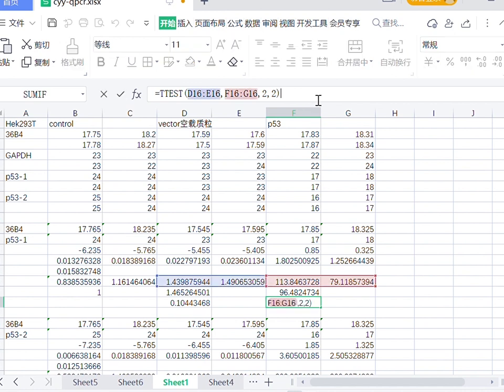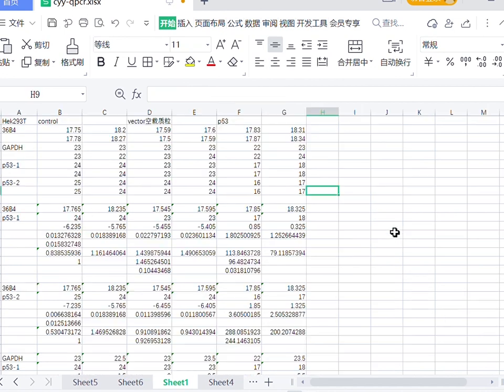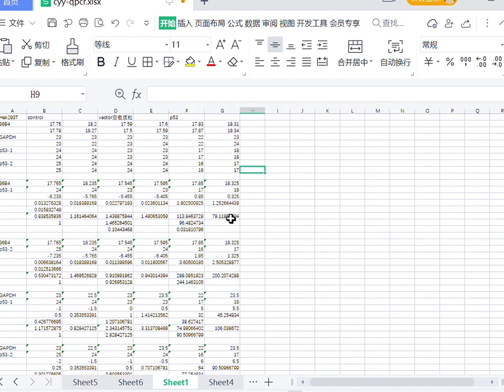If there are more samples in one group and their distributions are tested, you can calculate the p-value in this way. Statistical correlation is not causation. Do this to the remaining groups and you will see the same trend in each group.